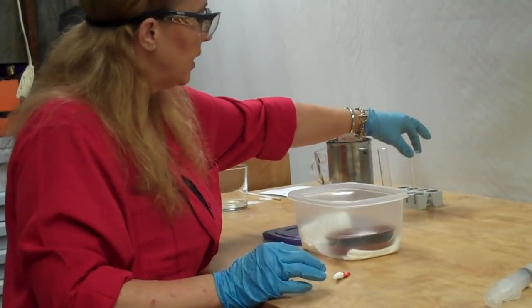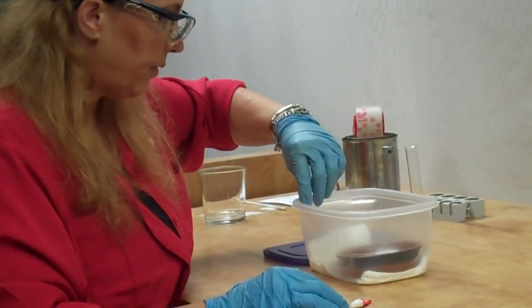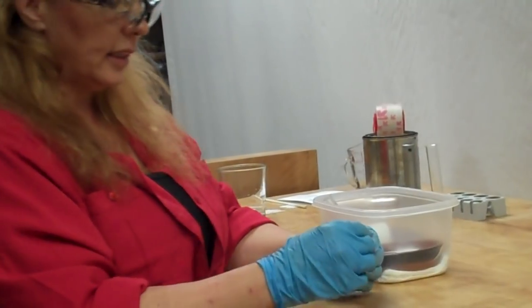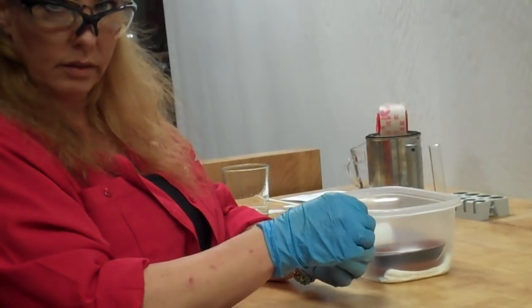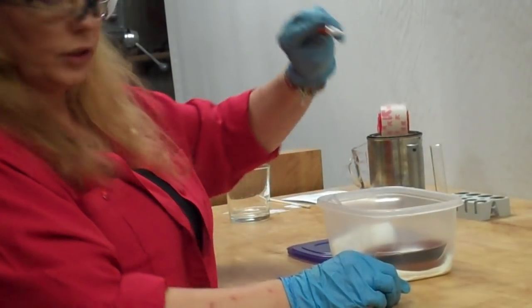And then this is the test tube here. I put some fingerprints on it, so hopefully that comes out after we're done here. And then I just have these little super glue single use ones here at home, so I have one of those too.